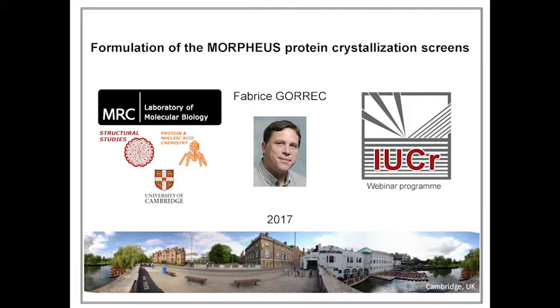As part of the IUCR's webinar program, I'm going to talk about the formulation of the MORPHEUS protein crystallization screens developed within our facility. Technology developments, including innovative screens, are needed to obtain X-ray diffraction quality crystals from increasingly challenging protein samples.